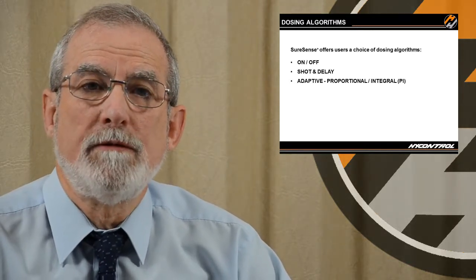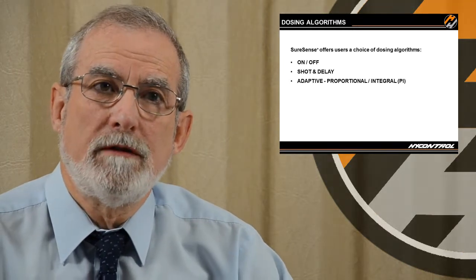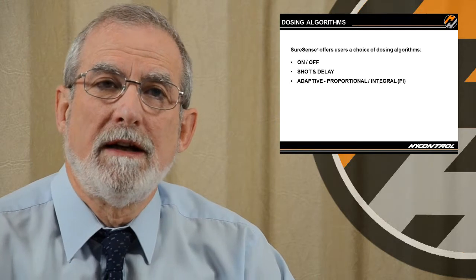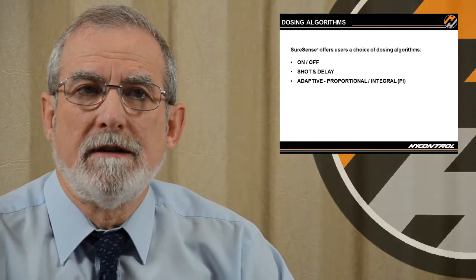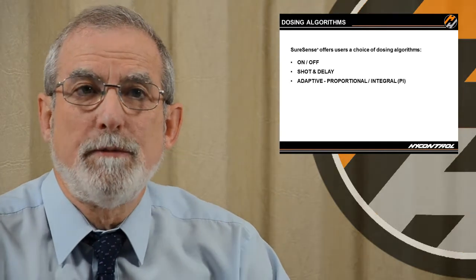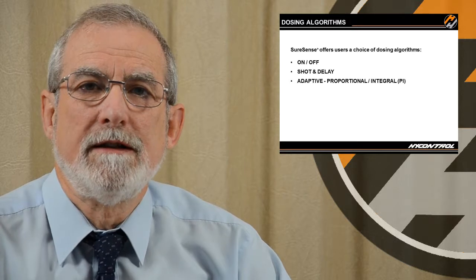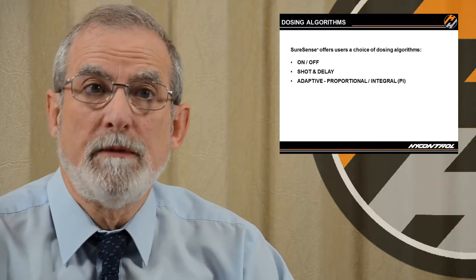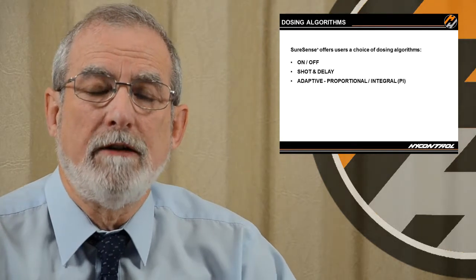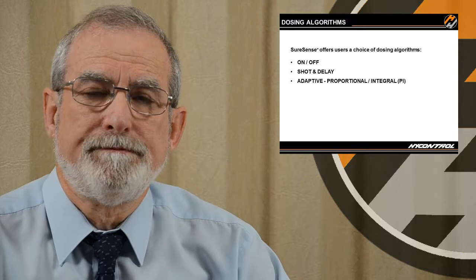That will cause the foam to subside, and the foam will drop down and come nearer to the set point. The set point, if you remember, is 50% that we're looking for. So as the foam drops down to 50%, the antifoam addition will get smaller. That's the proportional term. It's the simple proportion of the error. Bigger error, the more antifoam we add.